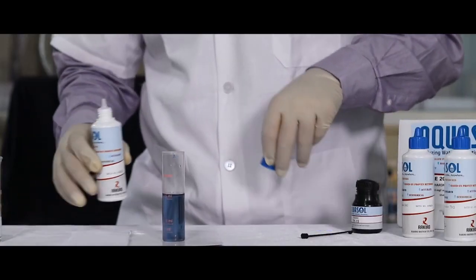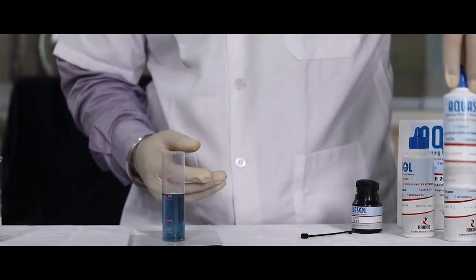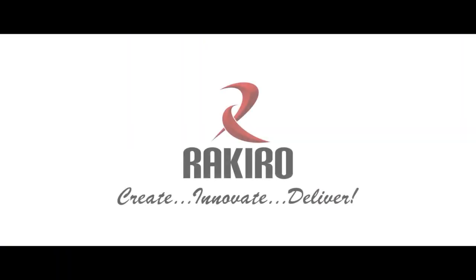We have similar tests for calcium, magnesium, alkalinity, and chloride. For better understanding of this product, please refer to the impact leaflet provided.